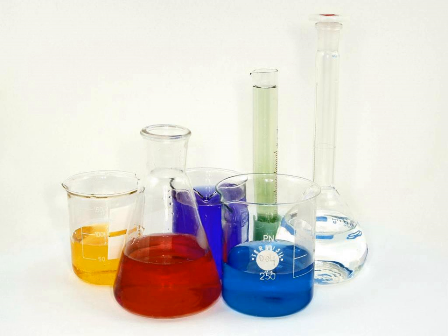Flasks are narrow-necked glass containers, typically conical or spherical, used in a laboratory to hold reagents or samples. Examples of flasks include the Erlenmeyer flask, Florence flask, and Schlenk flask.